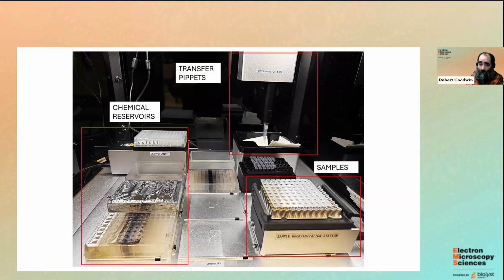Depending on what country you're in, with uranyl acetate there are a lot of regulations on whether or not you can get it. I know in some places they use lanthanum. We have tried that as well just to see, but we still had better results with the uranyl acetate. I think that is called uranyl-free or uranyl-less. So I know some countries can't get uranyl acetate. We can still get it here, and we use uranyl acetate.